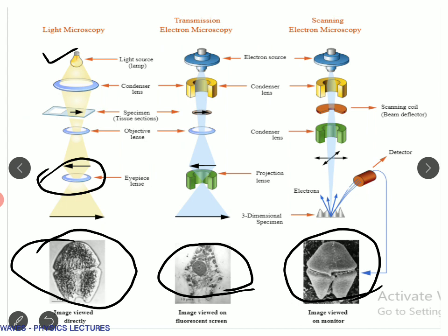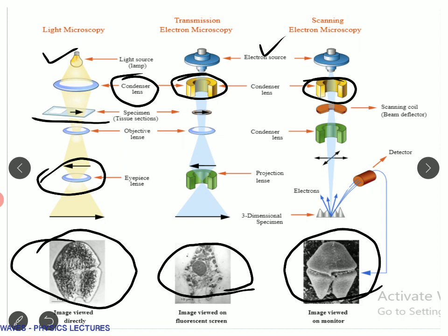In a transmission or a scanning electron microscope, basically the electron is the source. How we are going to produce the electron is something we will keep for later lectures. And then we have got a condenser lens, which might be glass, just as a magnifying glass is used to condense or focus a signal. We basically use a condenser lens where you can apply an electric or a magnetic field to focus the electrons. Then we keep the specimen here, so you can have, for example, a leaf, which you have used in your biological classes to look into the veins of the leaves and so on.